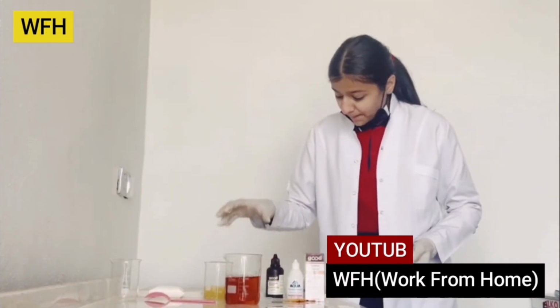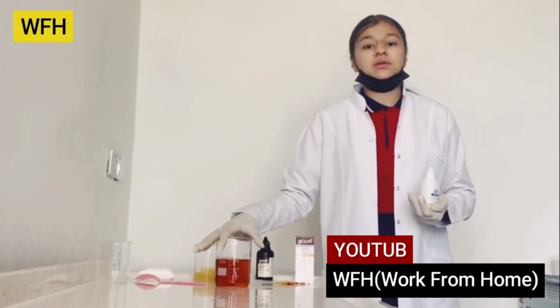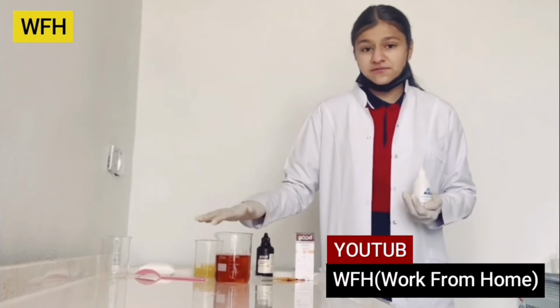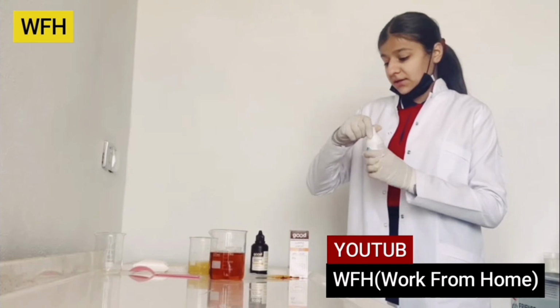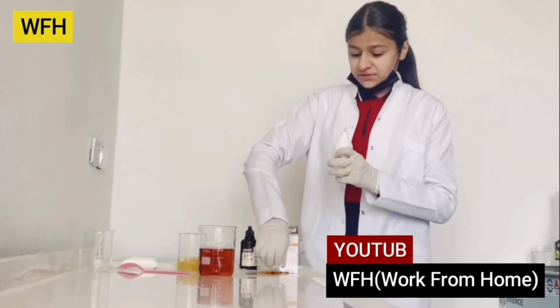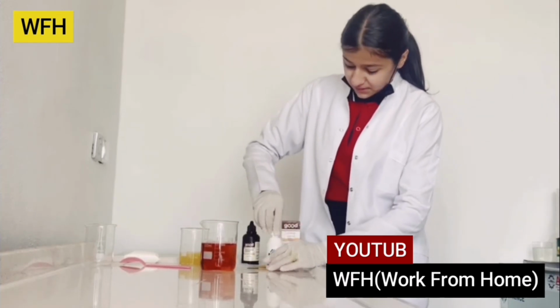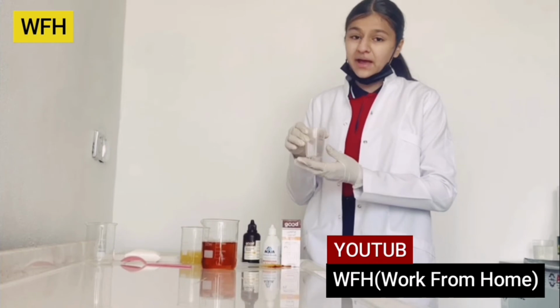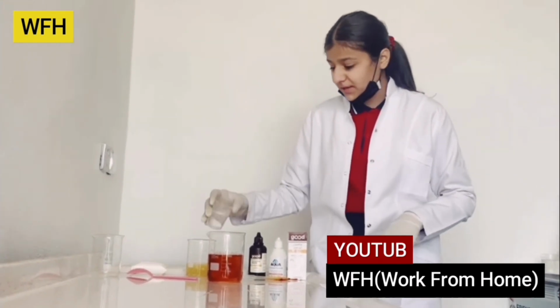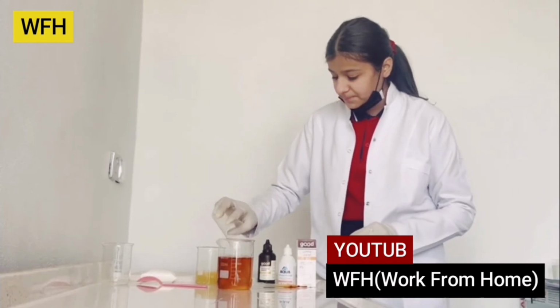Before I put hydrogen peroxide, I want to say that when I put hydrogen peroxide into this beaker with iodine, the color restores as the first color. I mean the water color, and you know the water color is white. Take a look. So as you know, this is hydrogen peroxide, and here in this cup, I have 60 milliliters of hydrogen peroxide. I'll put this hydrogen peroxide into this beaker with iodine.